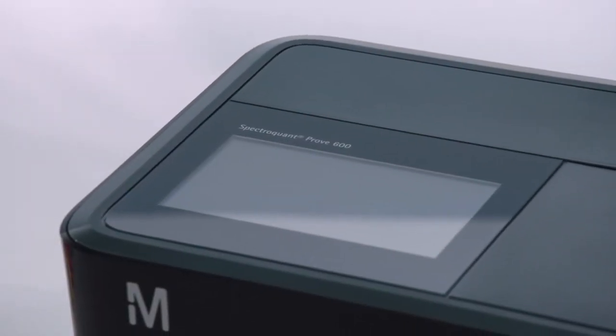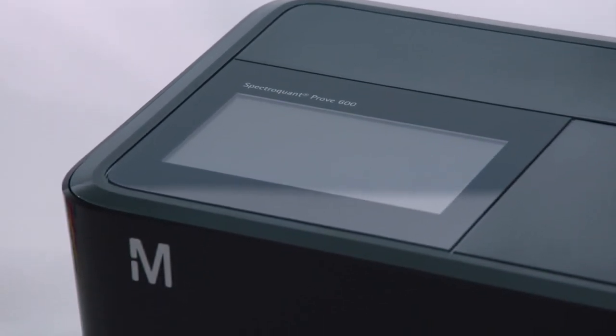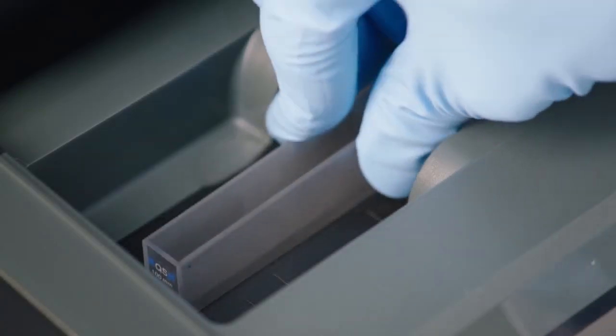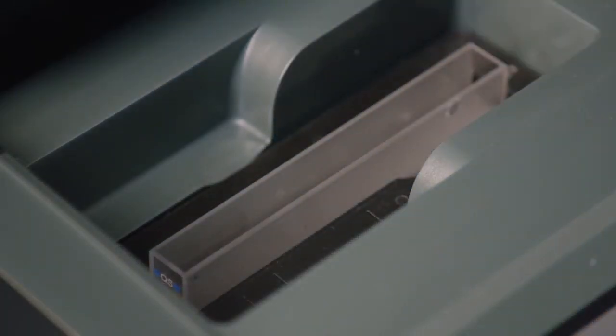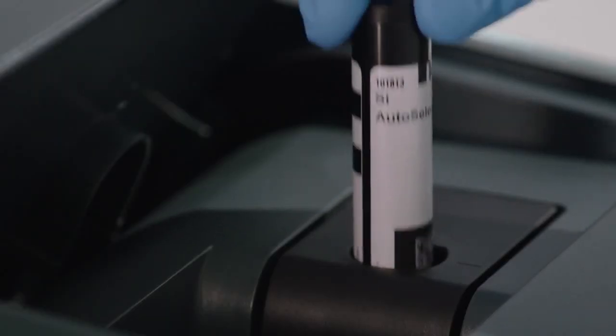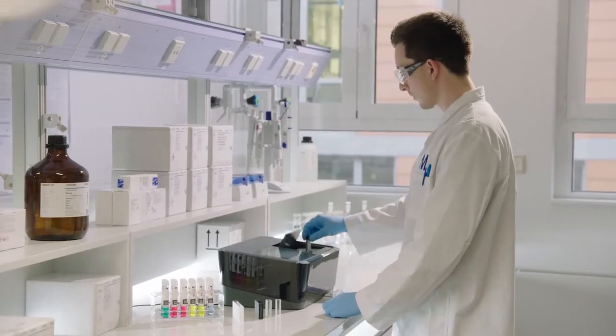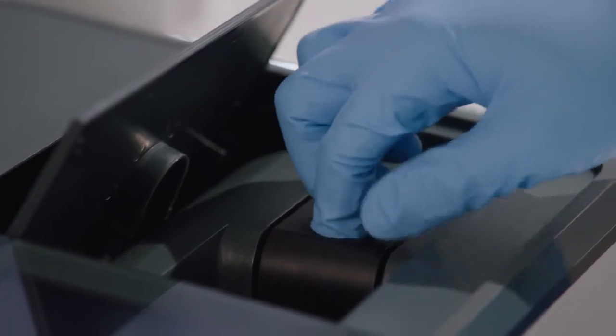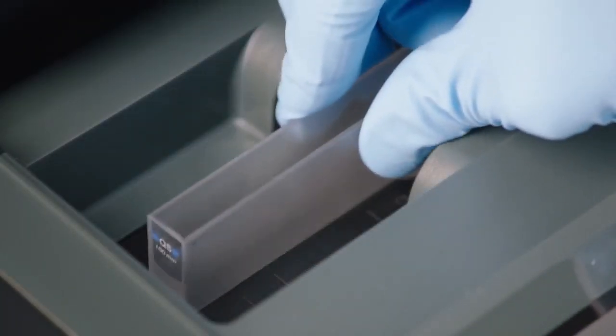SpectraQuant Prove 600 also offers a more sensitive measuring option using 100 mm cuvettes. Insert the auto selector for method recognition as usual. Then remove the auto selector and the round cell holder. Now you can insert your 100 mm cuvette and start your analysis.